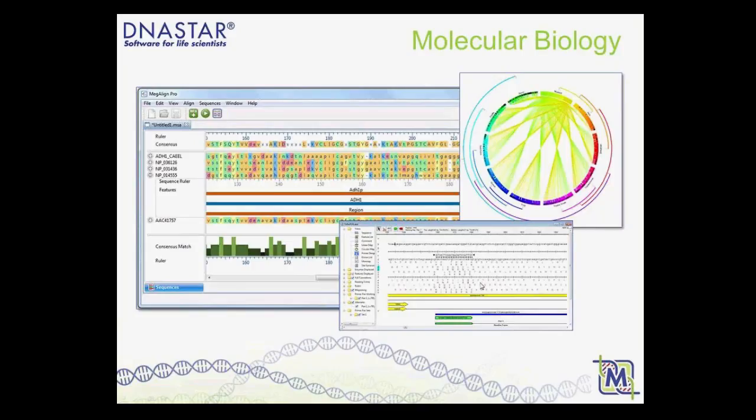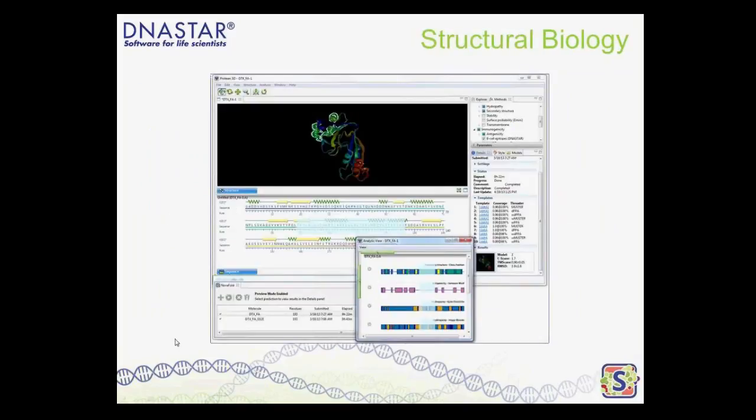We can also do sequence editing, virtual cloning, primer design, sort of the basic tool sets. In structural biology, we have some really excellent new tools for protein prediction and folding, and we're going to be developing some new tools here as well in the next year or so that can further enhance our ability to analyze 3D structures.